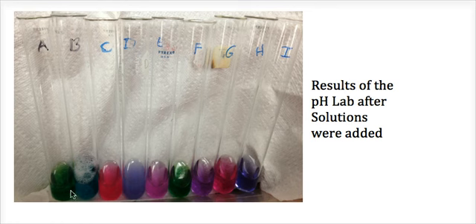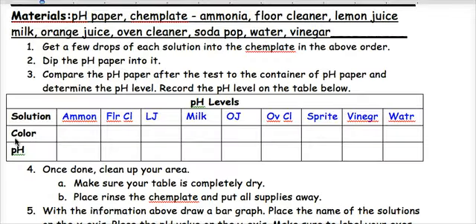So A is obviously a bright green color, B is sort of a turquoise color, C is bright pink, D is sort of a lavender purple, E is another pink, but it's maybe a little bit more purple, F is another shade of green, maybe a little bit more blue but green, G is violet colored, H is pink again, but maybe not quite as intense a pink as that one, and then I is purple, is violet. And we wrote those colors right in here.